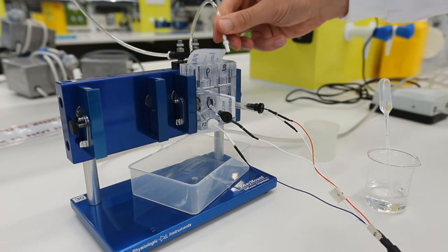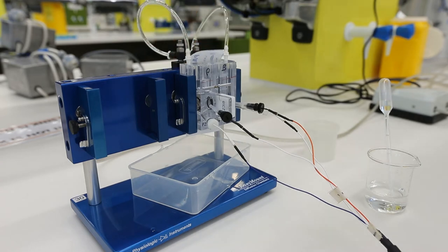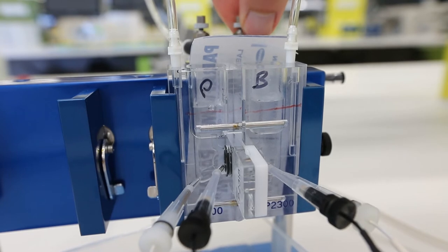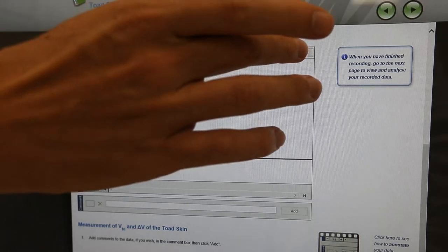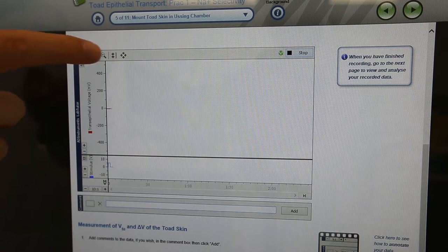Next, connect the clear air tubes on the back of the frame to the Ussing chamber, as shown here. With the air pump turned on, adjust the airflow using the knobs on the top of the frame. The air bubbles help the solution to circulate throughout the chamber. Once you have done this, go to the appropriate page of your lab tutor notes and press Start in the top right-hand corner of the lab chart window.